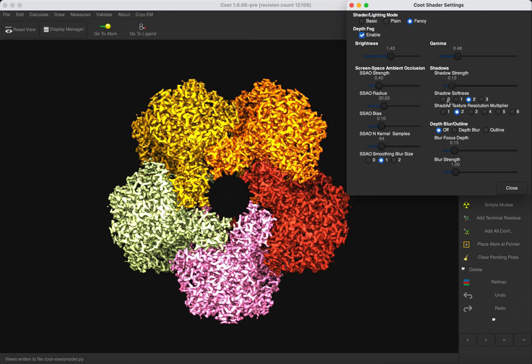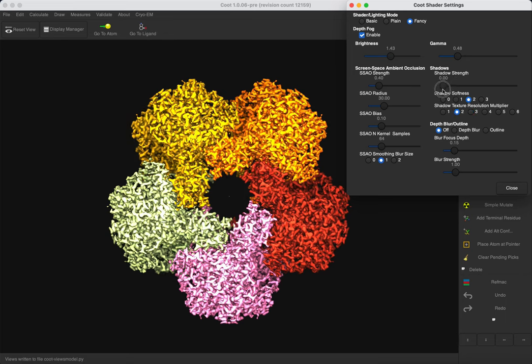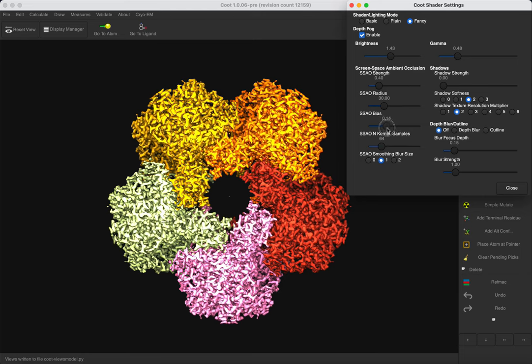The shadow softness control is used to control how much the shadow texture is blurred before being mapped to the molecule. The texture resolution controls how big the shadow texture is on the GPU. The Screen Space Ambient Occlusion bias can be used to reduce the artifact.